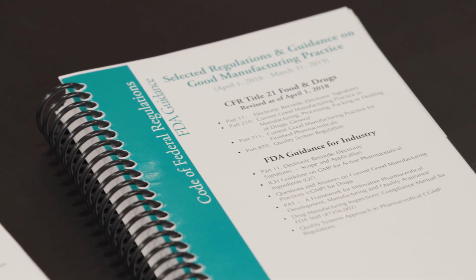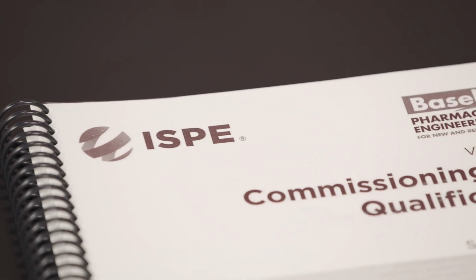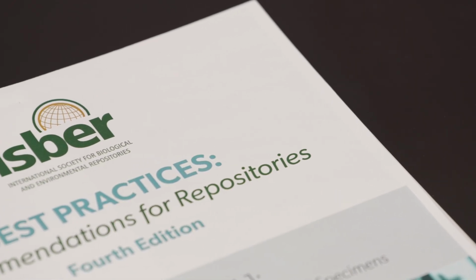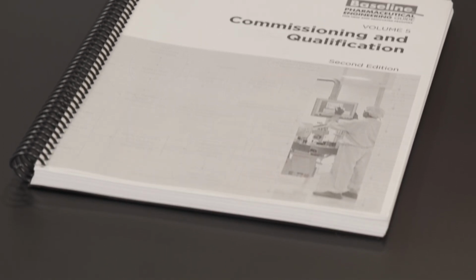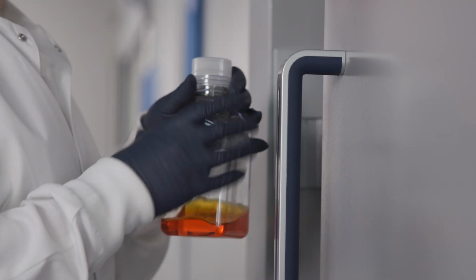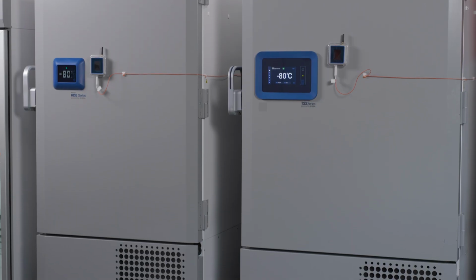Have you benchmarked organizations and societies to see what is common practice for your type of application? There are several best practice guides available that might be able to help. There are the International Society of Pharmaceutical Engineering and the International Society for Biological and Environmental Repositories, just to name a couple. Also, and this is very important, what is your qualification performance test criteria? You need to get specific here, as the test acceptance criteria will determine which freezer can be used. Depending on your needs, the United States Pharmacopoeia might be a good option for this information.